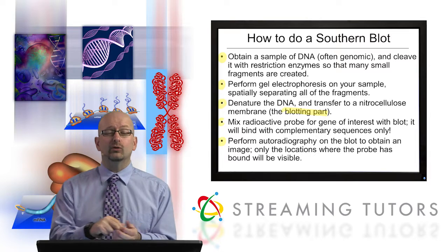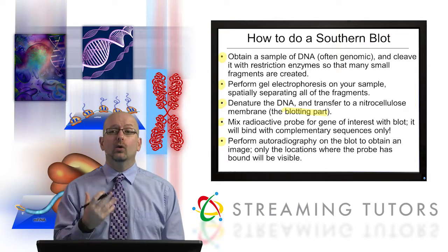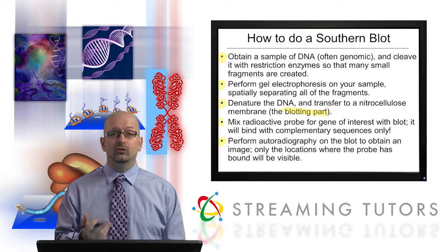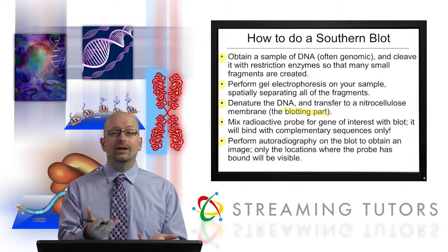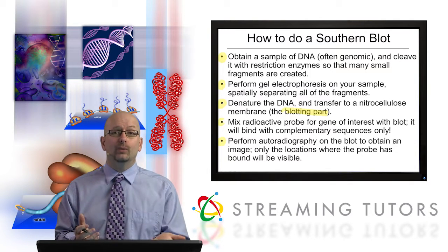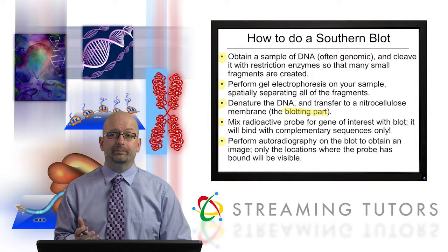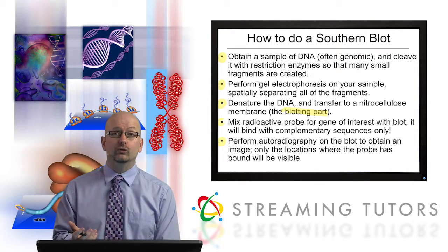Sorry to keep saying this, but there are certain similarities with the procedure we use to make a genomic library. The big difference is you're not taking these samples and saving them and putting them in cells. We're just doing an analysis to see what's there. And if you're doing a paternity test as one example, that's all you'd really care about, right?